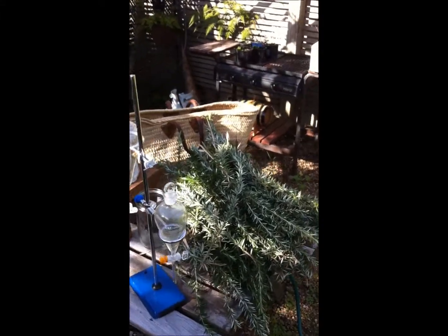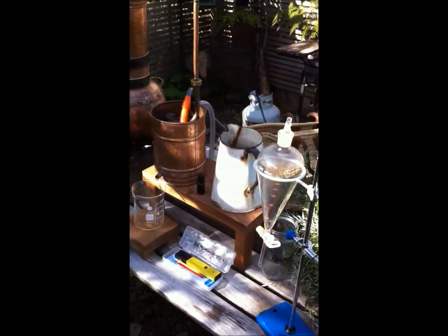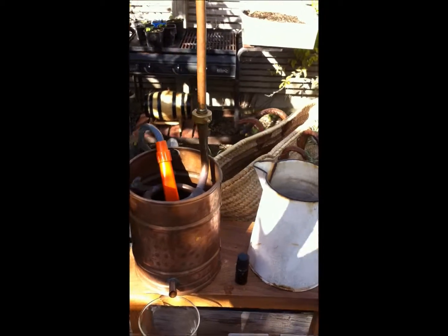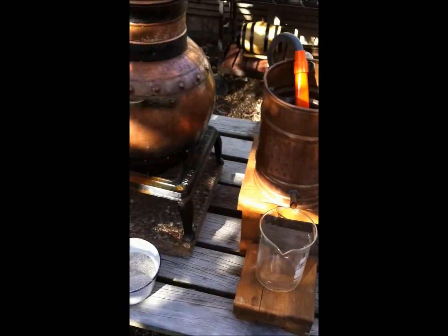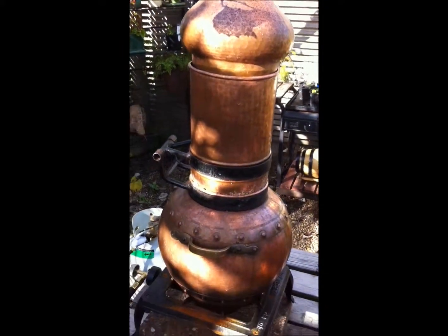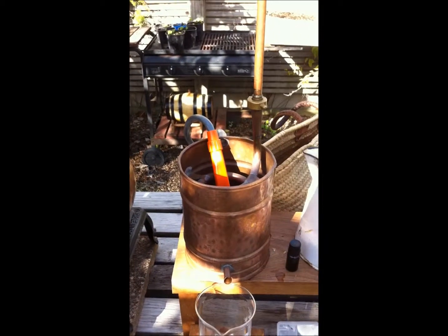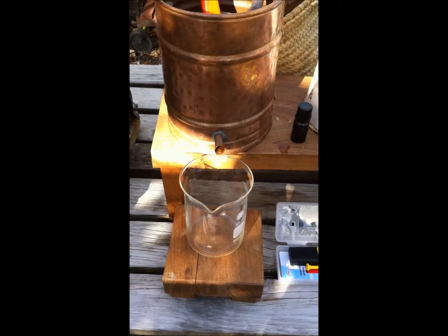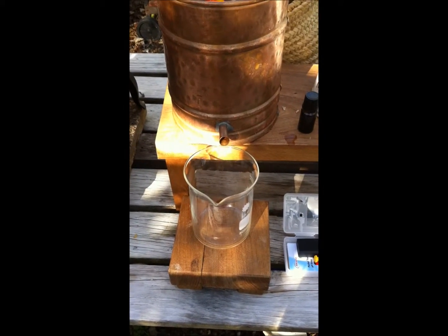My mission today is to distill a big bunch of rosemary and hopefully achieve 10 mils of essential oil. I'm all set up and doing a hot water distillation to make sure my still is clean. I'll run the hot water through until the distillate comes out clear and without any odor.